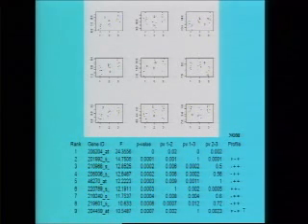1. And if you look at the strip chart corresponding to this 9th rank gene, again the picture is more or less similar to the 2nd rank gene. This has the gene expression values slightly at a higher level in the 1st and 3rd group and at a low level in the 2nd group. So the profile of the gene is again plus, minus, plus.